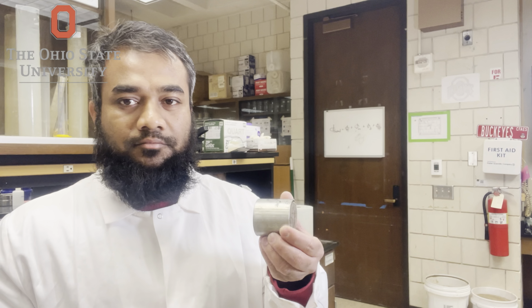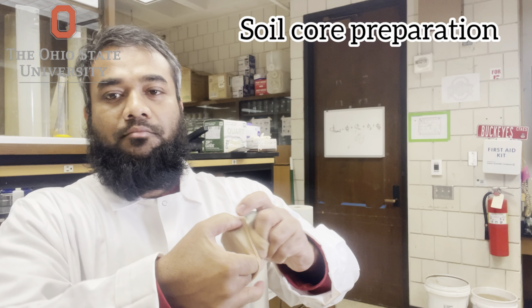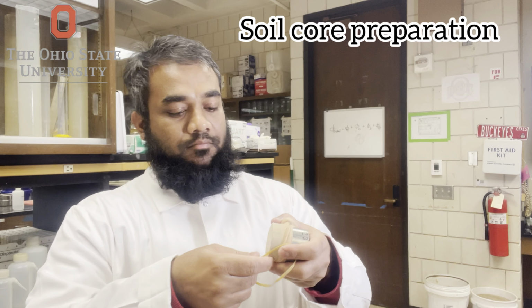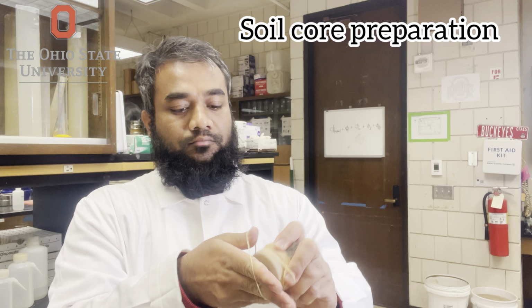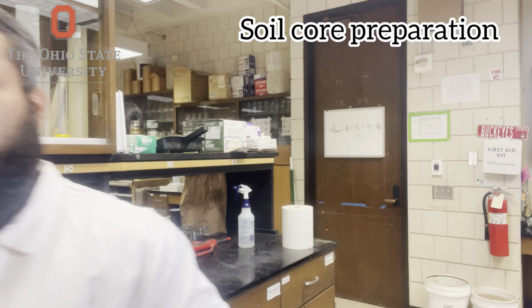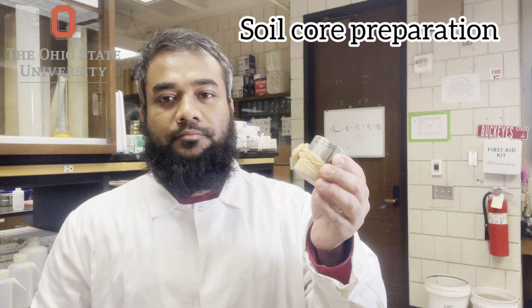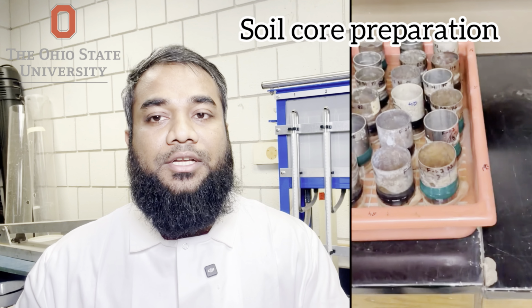The next step is saturation of the soil core. Before measuring saturated hydraulic conductivity, the soil core must be fully saturated. Saturation is done by placing the core on a porous surface, allowing water to rise slowly by capillary action from the bottom. This avoids air entrapment, which can significantly reduce measured conductivity.